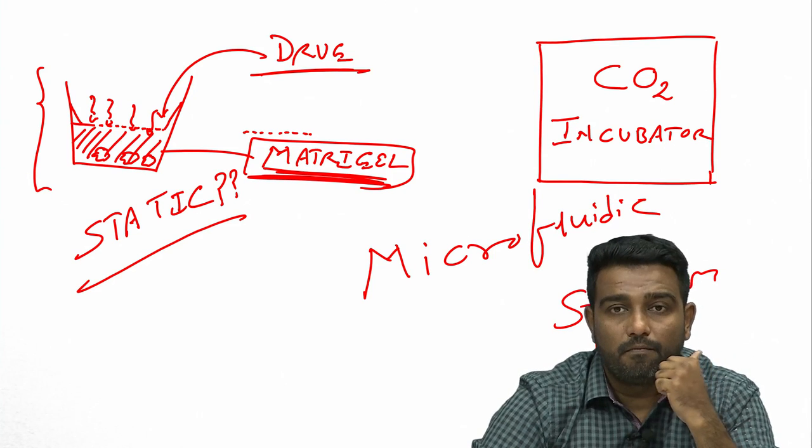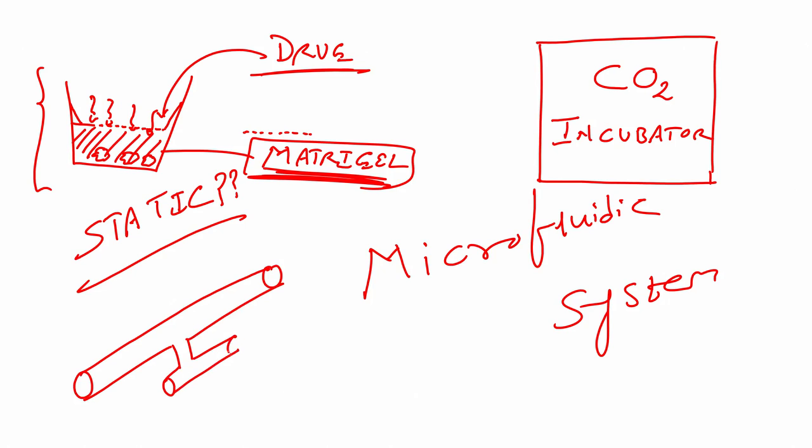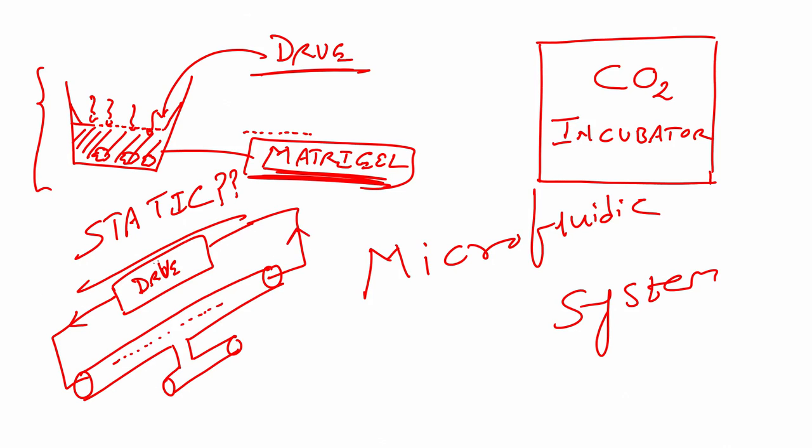Microfluidic system, all right. So, let us see how we can create this microfluidic system, okay. So, I have a channel, I will teach you how to create it, okay. Right now, you assume that with the help of microengineering, you have formed a microfluidic channel. This is a channel in which you have a drug in a reservoir, right, and you have created an inlet, it flows through here, it comes out here and it flows continuously, alright.